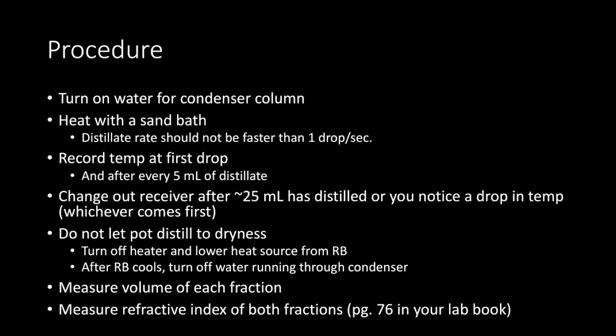You're going to want to record the temperature at the first drop that you see, and you'll need to take temperature recordings after every 5 milliliters of distillate. We will be creating the simple versus fractional graph that you saw an example of in the pre-lab. So make sure to record this temperature very diligently.